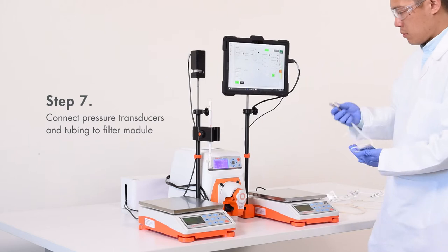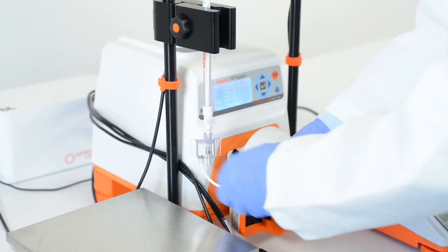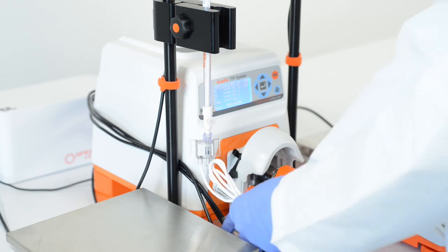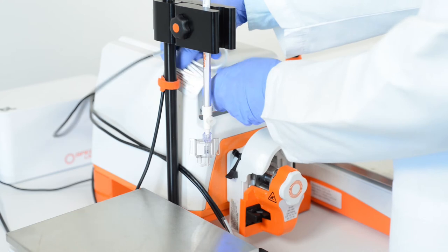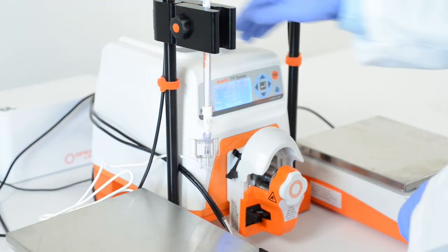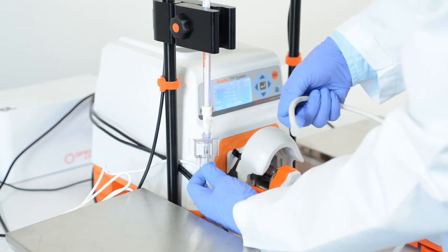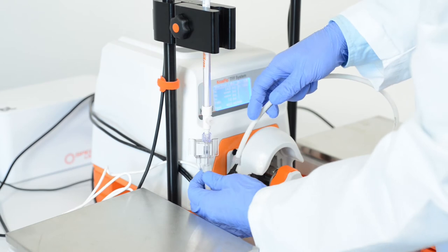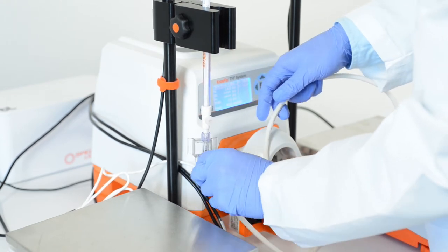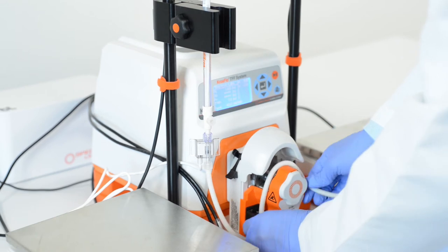Connect the pressure transducers and tubing to the filter module. Connect the transducers to the appropriate ports on the pressure transducer cable. Connect tubing to the filter module, and thread tubing through the peristaltic pump head.